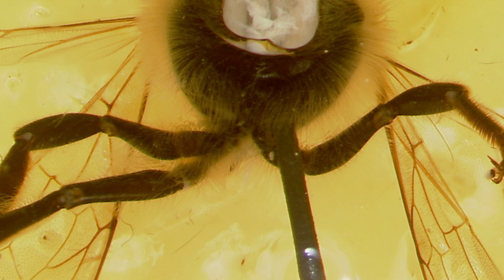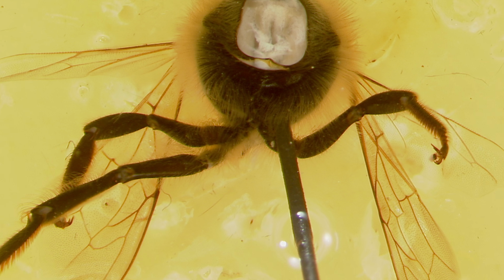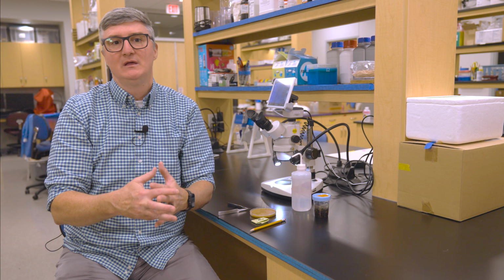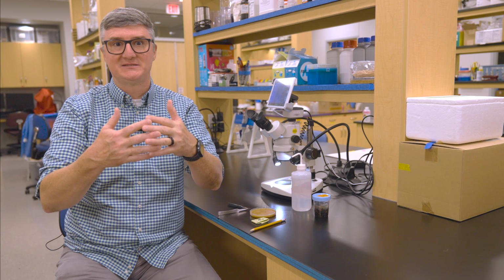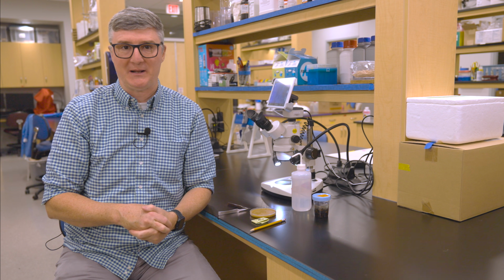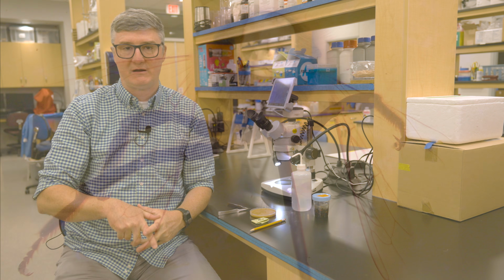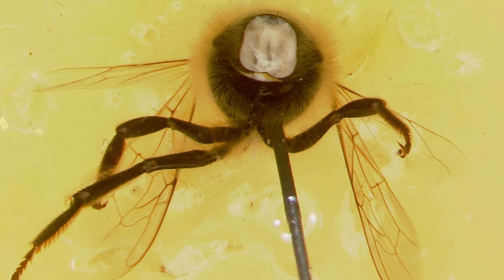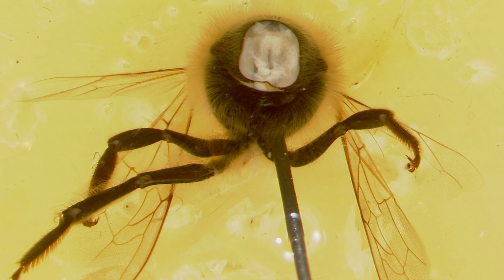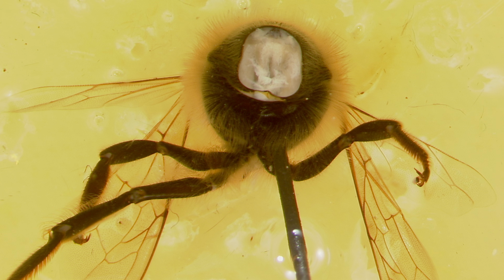You remove the abdomen because I've found when I'm working with the bee under the microscope, if I accidentally press on the abdomen, it can cause that abdomen to release nectar or honey through the bee's digestive system and out the top of the thorax, making it difficult to see what I'm looking at. In other words, squeezing that abdomen can cloud my field of view when I'm working around the thorax. So I remove the bee's head and I remove the bee's abdomen. So what you should have left in your hand is you're holding the bee by its wings, the thorax is facing you, the legs of that thorax are up towards you.